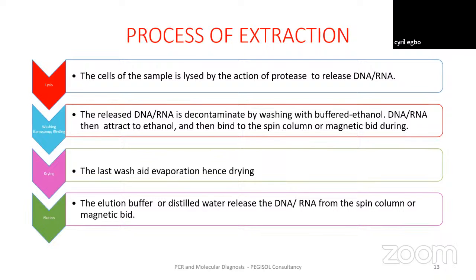At this stage, you use your wash buffer AW2, which removes the remaining contaminants and at the same time dries the DNA template. The last stage is where you release the DNA from the column or the magnetic beads using elution buffer or DNA-free distilled water.